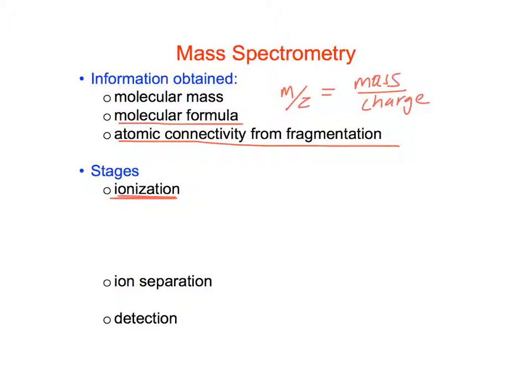So, like I said, we're going to use this electron impact. And so this is going to go from our molecule, we usually call this M, to some ion. Right? And we're going to usually get a species that we're going to draw like this, and I'll talk about that more in a minute.